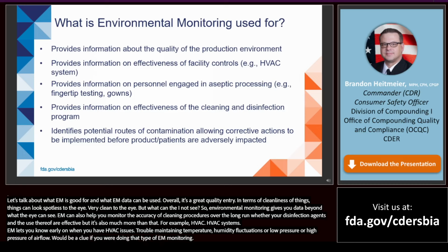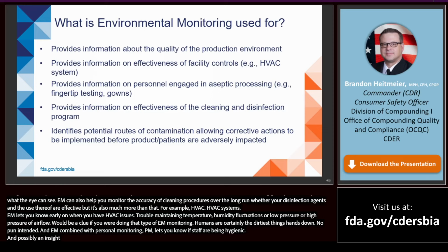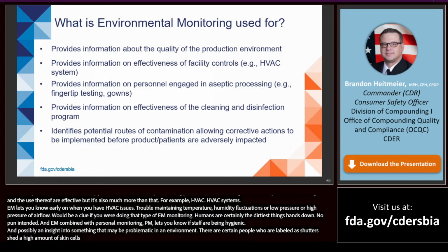Humans are certainly the dirtiest things in a clean room, hands down. No pun intended. And EM combined with personnel monitoring, PM, lets you know if staff are being hygienic and gowning properly, and possibly gives insight into some behaviors that may be problematic in an aseptic environment. There are certain people who are labeled as shedders that shed a high amount of skin cells, and environmental monitoring may clue you in on if that might be an issue with one of your operators.